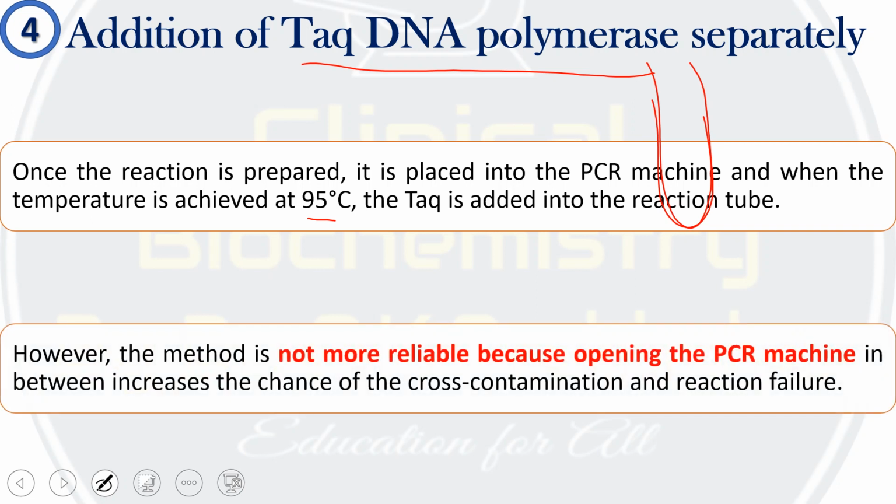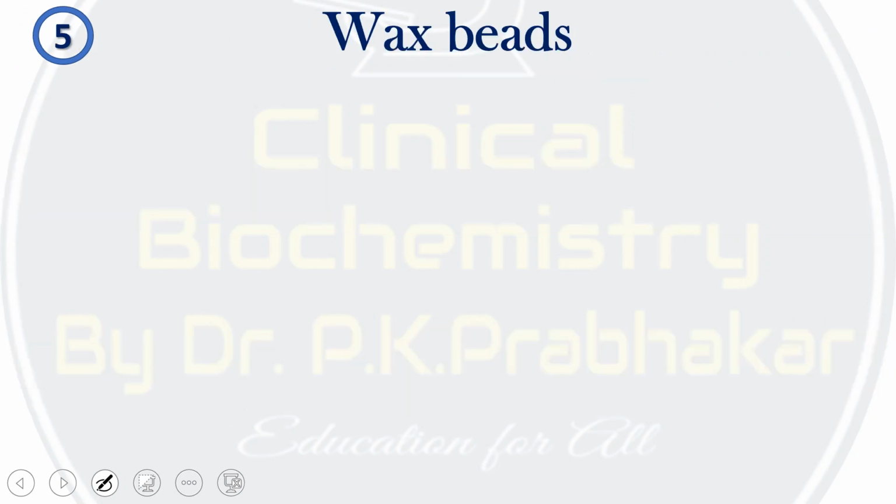But this method is not very reliable, because if you open the tube, cross contamination or reaction failure may occur. So that is the drawback of this process.